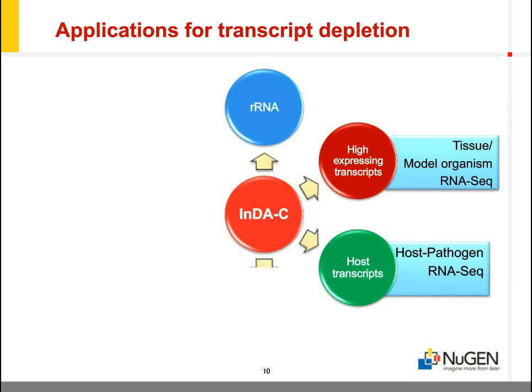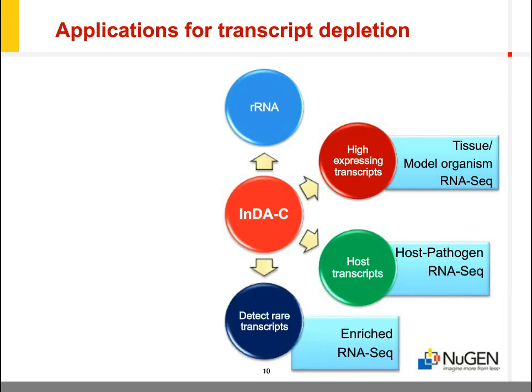Depletion of highly expressed transcripts can increase the dynamic range of transcripts detected during whole transcriptome or mRNA-seq studies. This provides more information on low or rare transcripts at the same sequencing depths, facilitating the discovery of reference and novel genes.